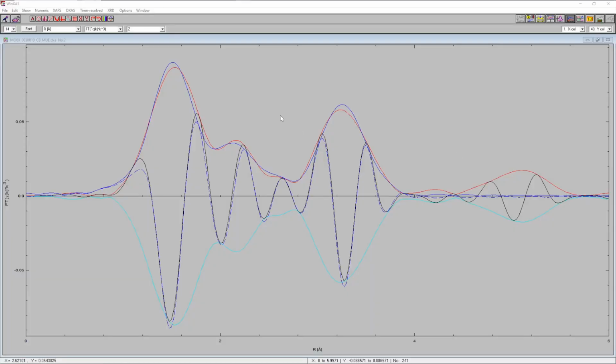So the refinement is done, and we are looking at the result of the last column, column number 40, in this automated analysis. On a side note, if the program appears to freeze during those automatic analysis steps, this is most likely because of Windows preventing the screen refresh. So just give it some time and be patient, and in most cases the program will return once the calculation has finished. So here now we can look at the results.